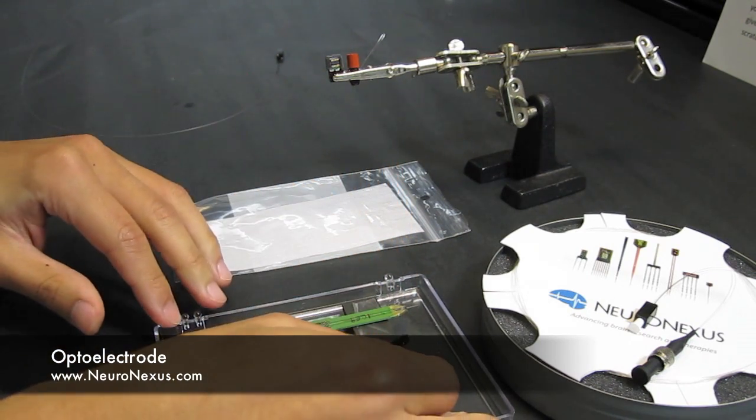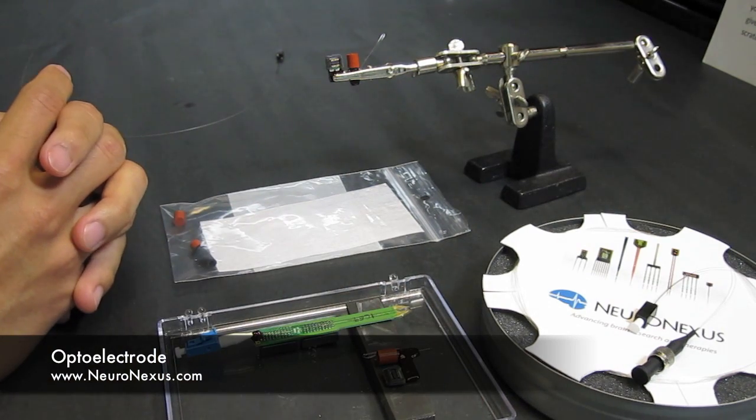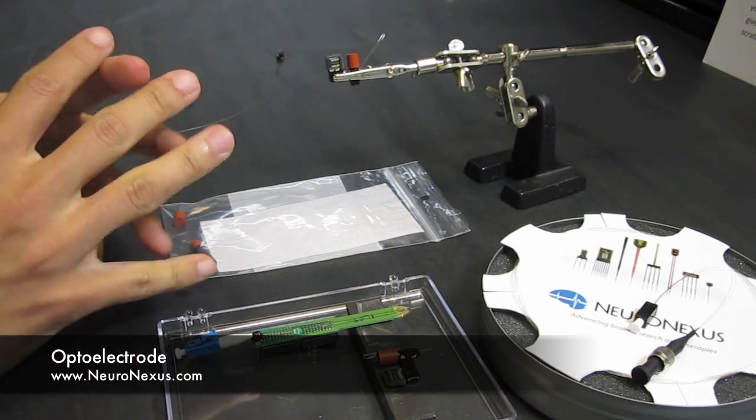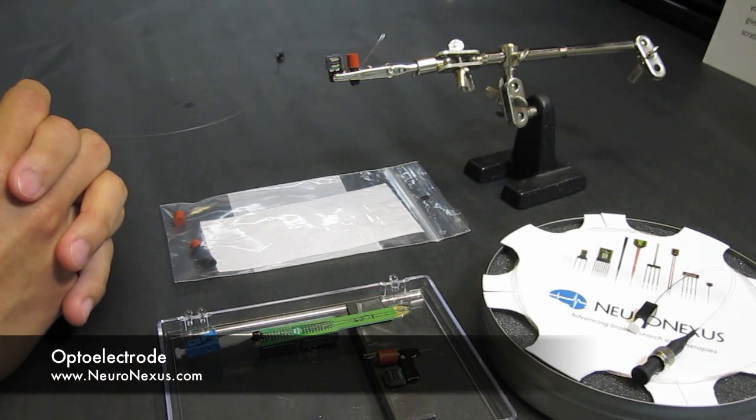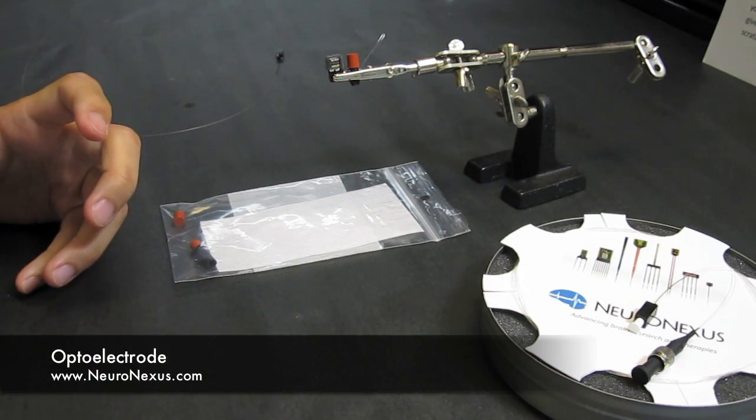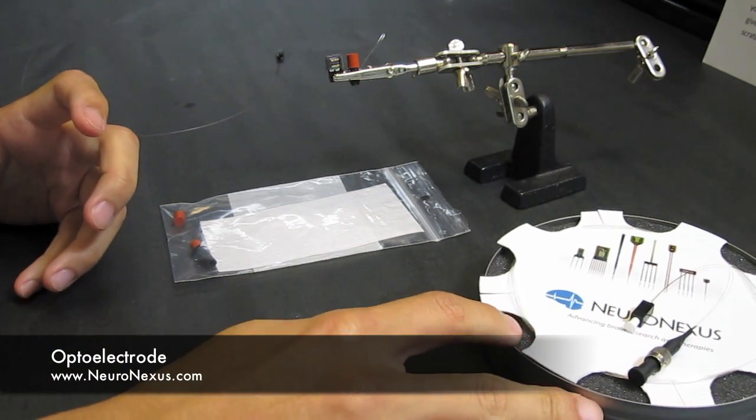The acute usually has dip pins and the chronic can have either a ZIF or an Omnetics connector. You'll need an optical patch cord to connect your light source to one of these.